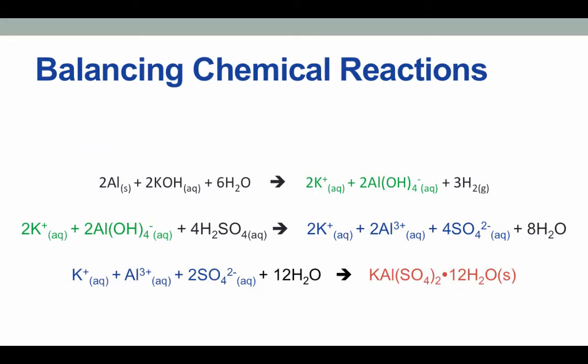In the final step of the reaction, you allow the solution to cool down, thus the alum forms crystals and precipitates out of the solution, allowing it to be collected by vacuum filtration. You will note that the reactants in reaction 3 are very similar to the products in reaction 2. However, the stoichiometry is different.